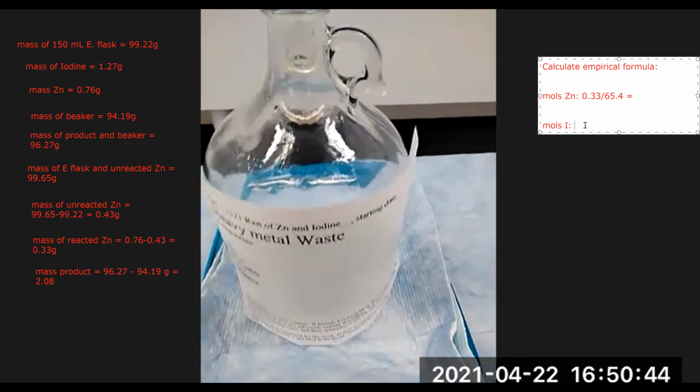And for moles of iodine, we're going to use the mass of iodine, 1.27, divided by its molar mass. Now we're only using the molar mass of I, not I2, because this is an empirical formula problem. 126.9.